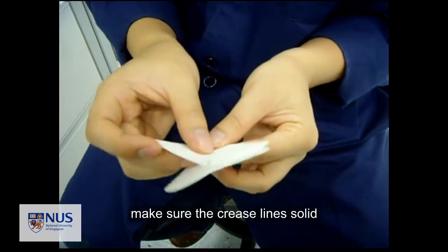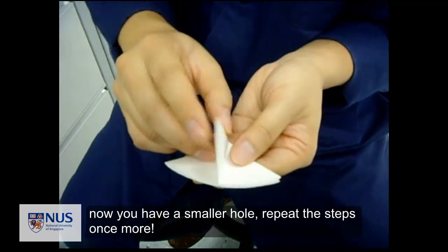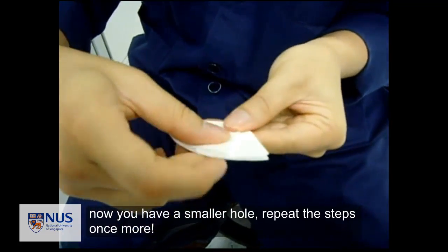Wash the demonstrator's hands carefully. When you open it, you see a flower shape. Open it and fold it in the manner that is being demonstrated.